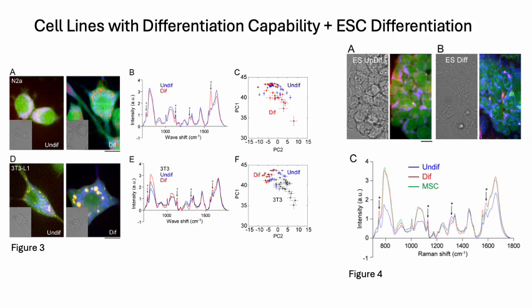And taken together, these findings show that Raman spectroscopy can detect a full range of differentiation states, from early and partial transitions to nearly mature ones. And it can do this without using any labels or markers, just simply by detecting small but meaningful changes in the spectral features of the nucleus.